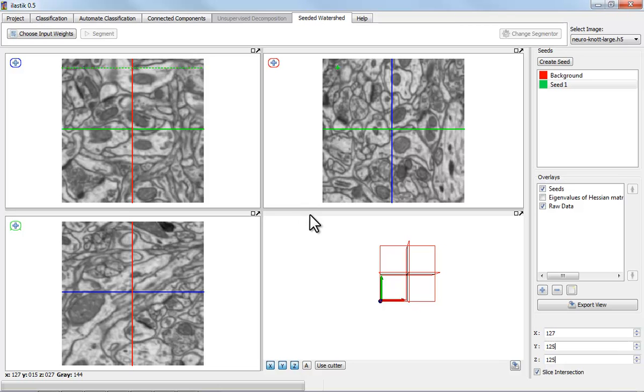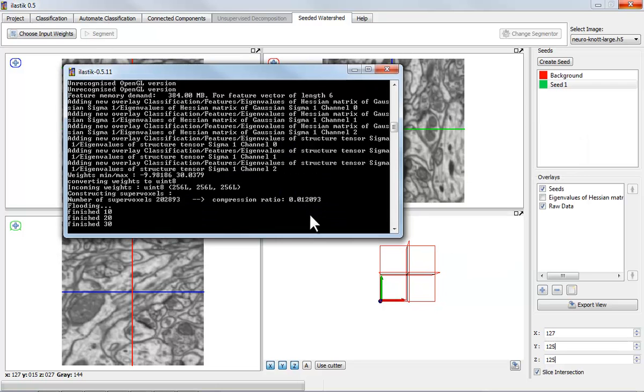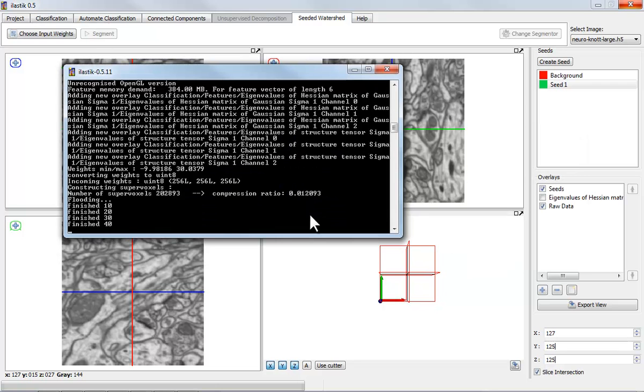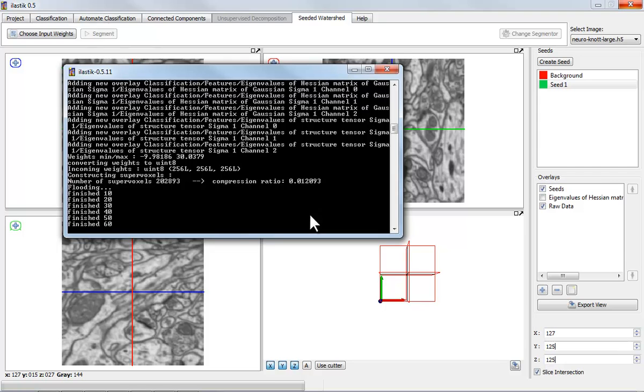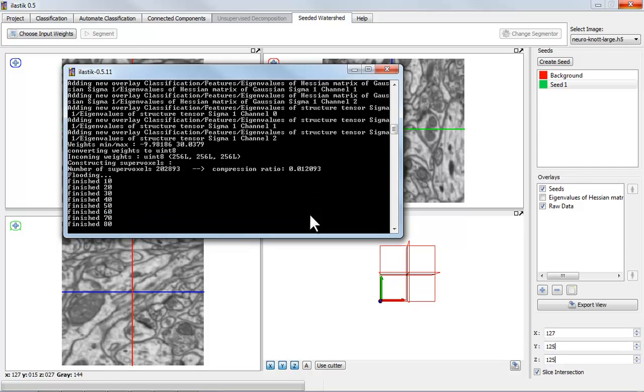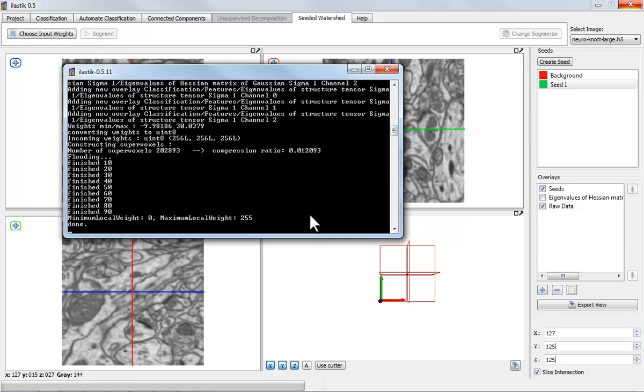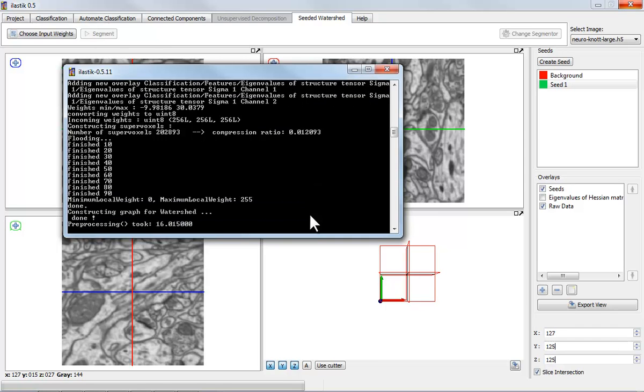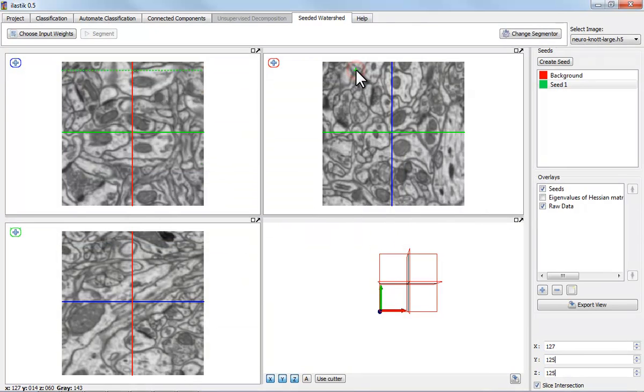The program now goes away and constructs a graph of supervoxels. This is an operation that needs to be done just once. And the advantage is that if we've done this once, we can achieve interactive response times later on to each of the seeds that we give, even when working on ten million voxels on a normal notebook.